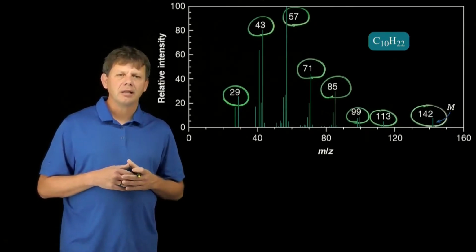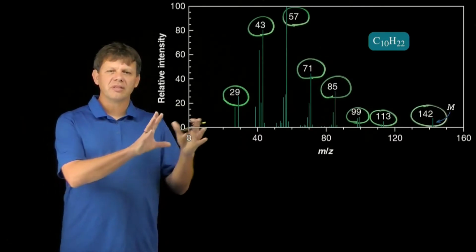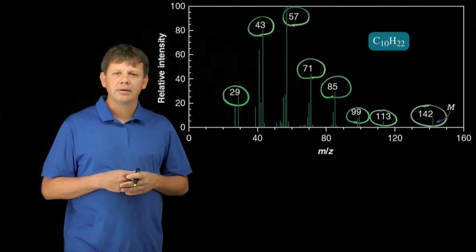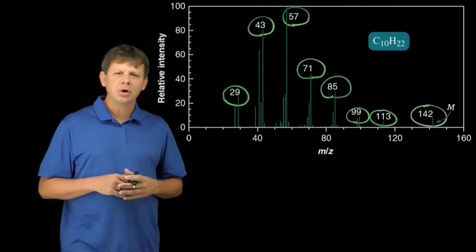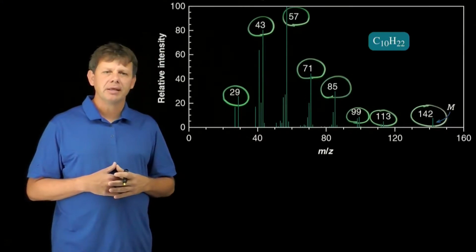This assessment acknowledges that based on the atomic mass units, there are 75 possible constitutional isomers that this could represent. And yet, fragmentation patterns are going to tell us that it's exclusively one constitutional isomer. Now, this particular spectrum has been chosen because it makes it easy to solve, but allows us to logically piece through what the mass spectrum is showing.